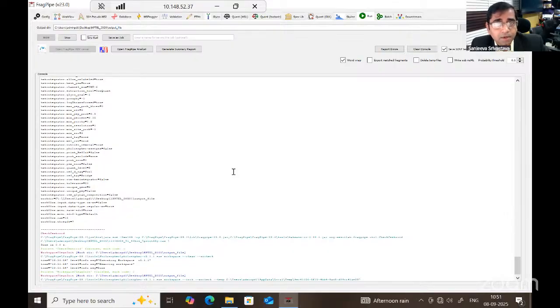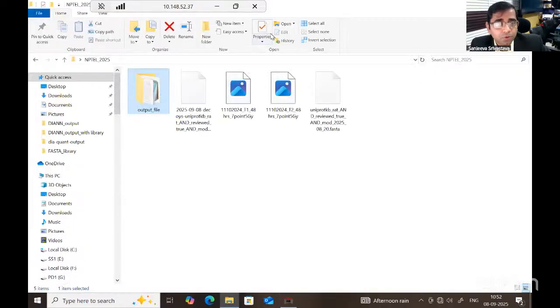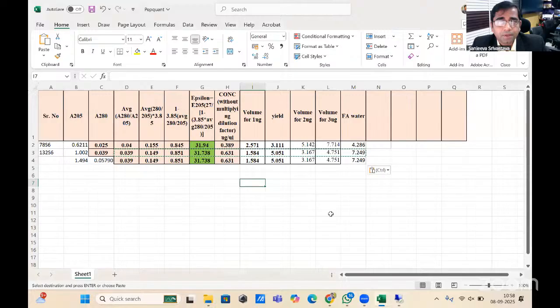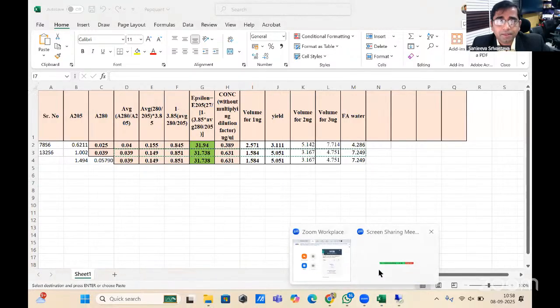Another software we will now show is Mascot from Matrix Science, which Ankit will briefly walk you through. If you have a very simple mixture of proteins and you want to identify their sequences and know what the best hit is, he will show how to do that using Mascot analysis. So you'll do that, Ankit.